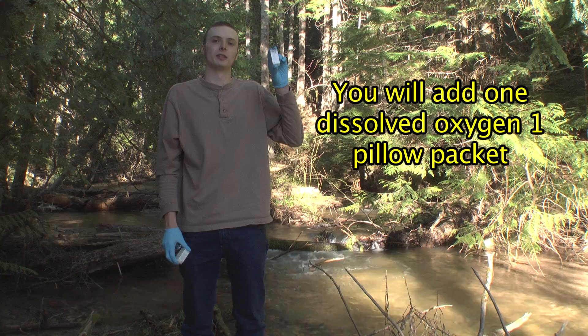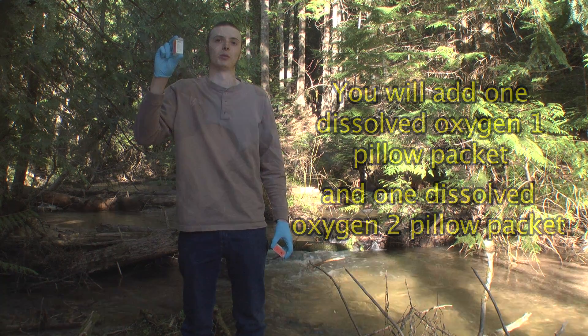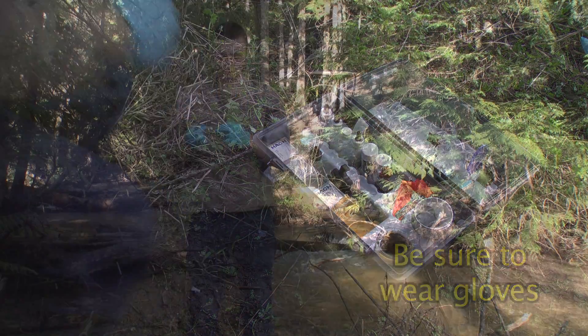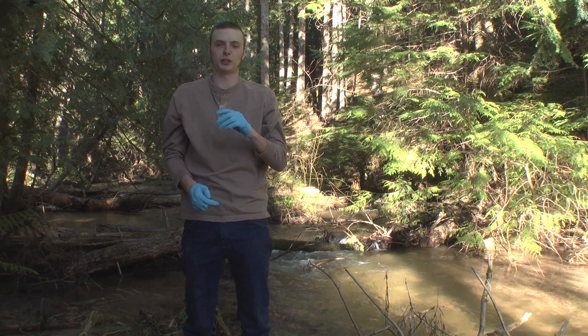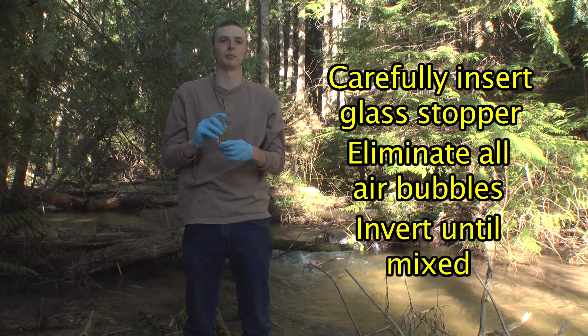You'll be adding one dissolved oxygen pillow packet number one and one dissolved oxygen pillow packet number two to your sample. Whenever you're handling pillow packets, it's important to wear gloves. Once you've added your pillow packets to your sample, carefully insert the stopper again, trying to eliminate any air bubbles. Invert several times until it mixes.